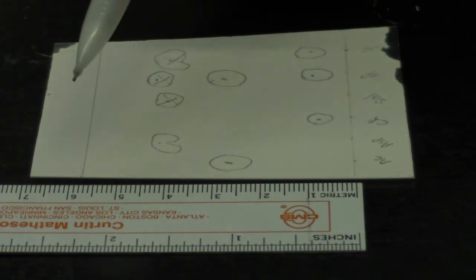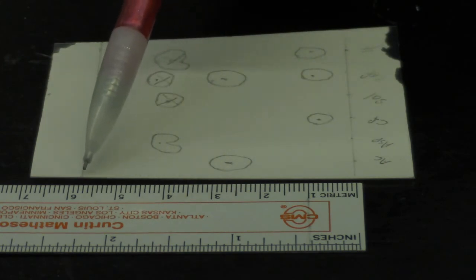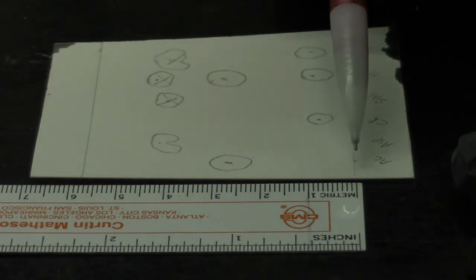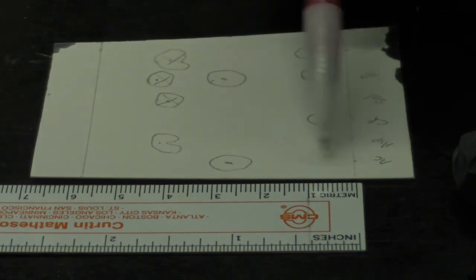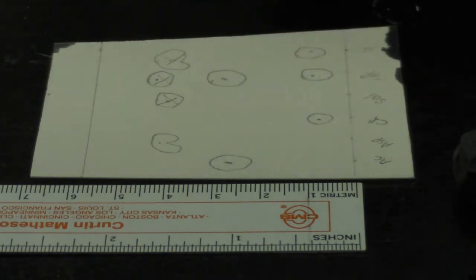So it's about 57 millimeters. So from the bottom line to the solvent front is 57 millimeters, and from the bottom to the center of the spot, the first spot, which is acetaminophen, I put a little dot here. From here to here is around 26 millimeters.